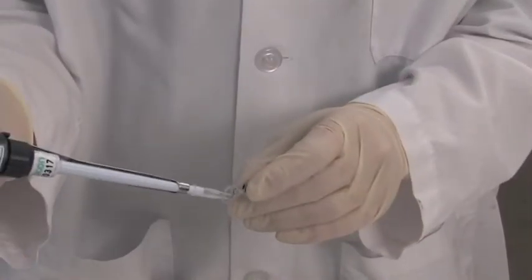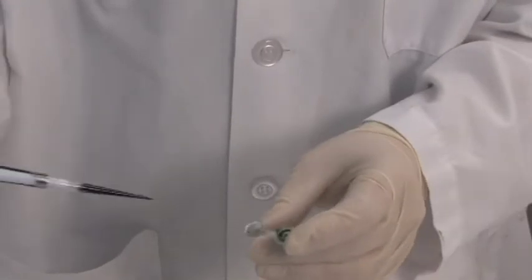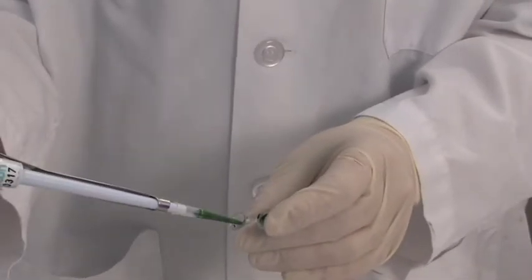When common polypropylene pipette tips are used with sticky protein samples, you may lose large amounts of your sample to inside tip surfaces.